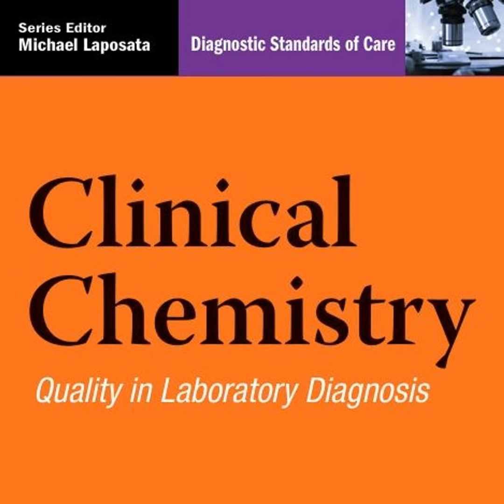Okay, let's move into segment 3, informatics. We're covering the LIS, the EMR, and the postanalytical breakdown. Right. So for our listeners who might not be familiar with that jargon, what are we talking about here? So the LIS is the Laboratory Information System. That's the specialized software where testing is ordered and results are processed. And the EMR? The EMR is the electronic medical record. It's the patient's permanent chart where clinicians view those results.